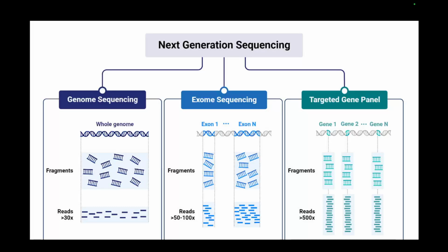So exome sequencing is a very cost effective method to find out variants that are present only in the genes, inside your exons of those genes. So exome sequencing becomes a very good method for that. Also, since you have to sequence a very small amount of DNA, because exons are, as I said, 1% of the DNA, it becomes cost effective as well.